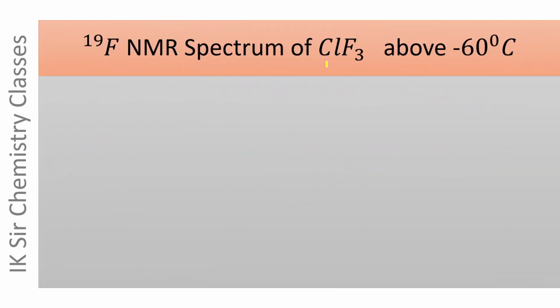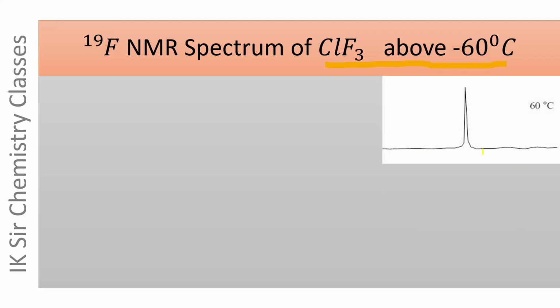The F-19 NMR spectrum of ClF3 above -60 degrees centigrade is given here.